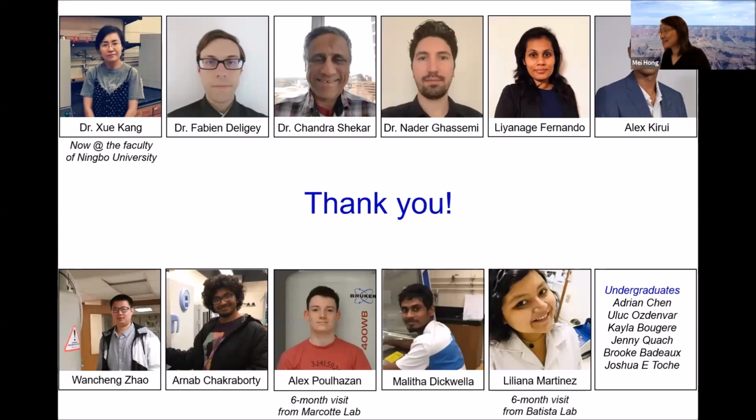Okay, I think we had a good set of questions. I hope I'm not missing anybody else's. Oh, here's another question. Can the fungus still grow after spinning? Exactly, that's a good point. If you measure them fresh and take them out of the rotor, they should be able to grow. So they're alive.